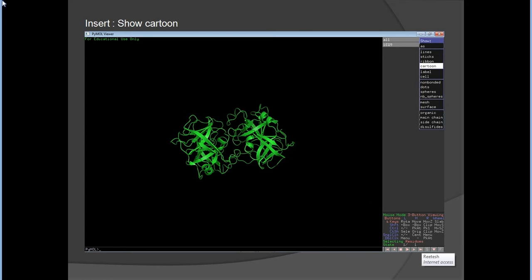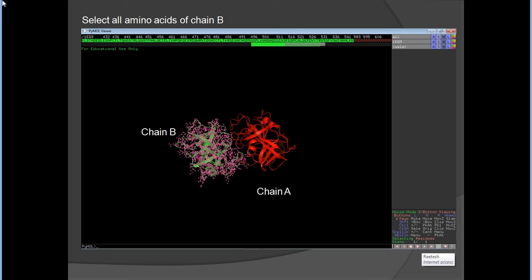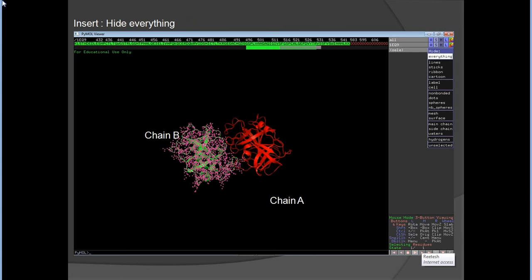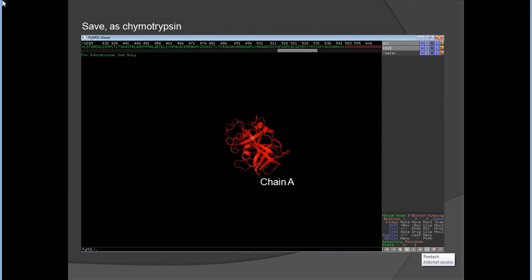Use S for show and type 'show cartoon'. You can see there are two chains: chain A and chain B. If you would like chain A to be red, type 'color red, chain A'. To work on chain A only, select chain B and hide everything for chain B. Now only chain A remains visible.